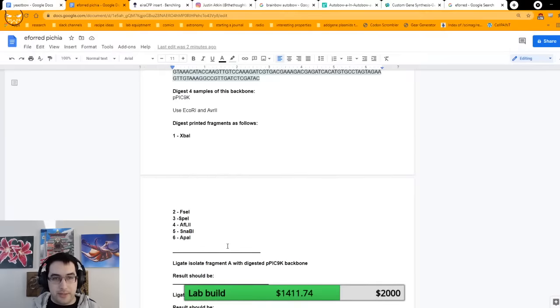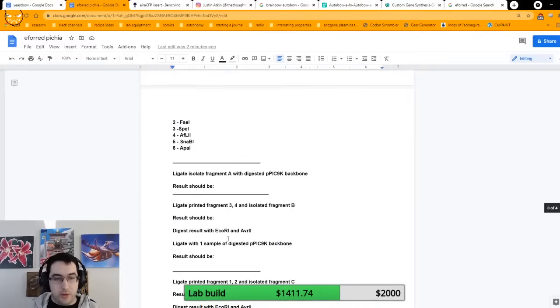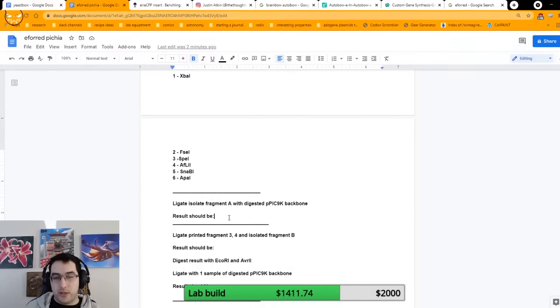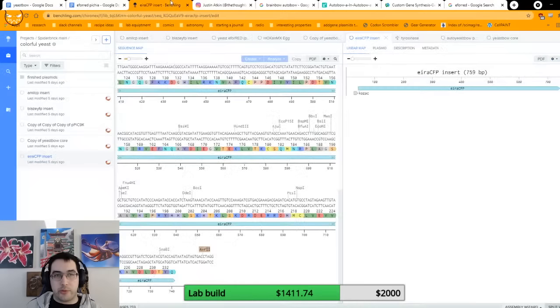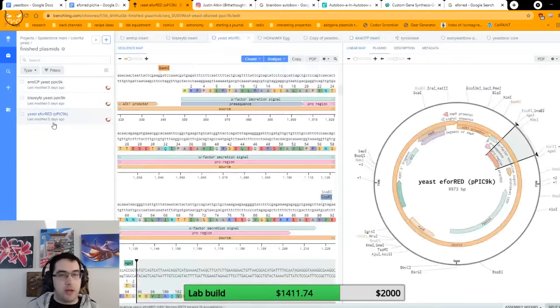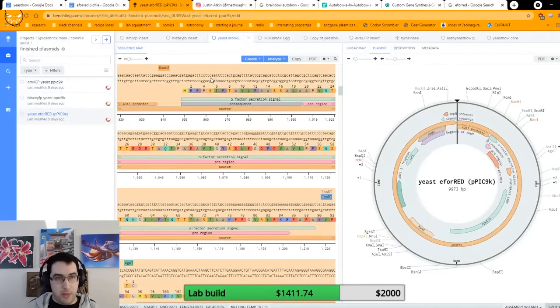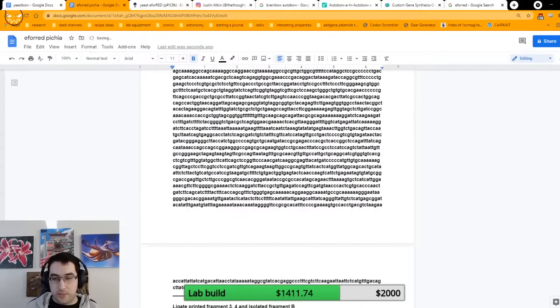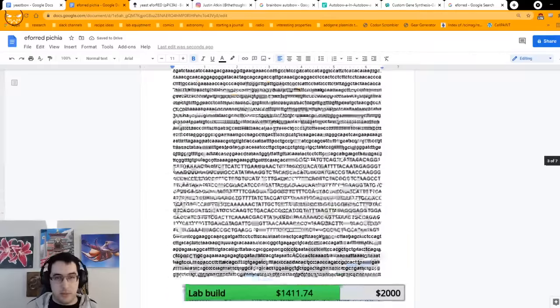Okay, lovely. So now I need to do all the results should be things. So in this one, I'm saying ligate isolated fragment A with digested PPIC. This is that first one that I mentioned, the pink one that just slots right in. So now if I go to finished plasmids, assuming I have actually done the thing, I can grab this. I can do this, go Control A, copy, and now I can just paste that in there. Why is that bold? I don't know. We're going to unbold this.